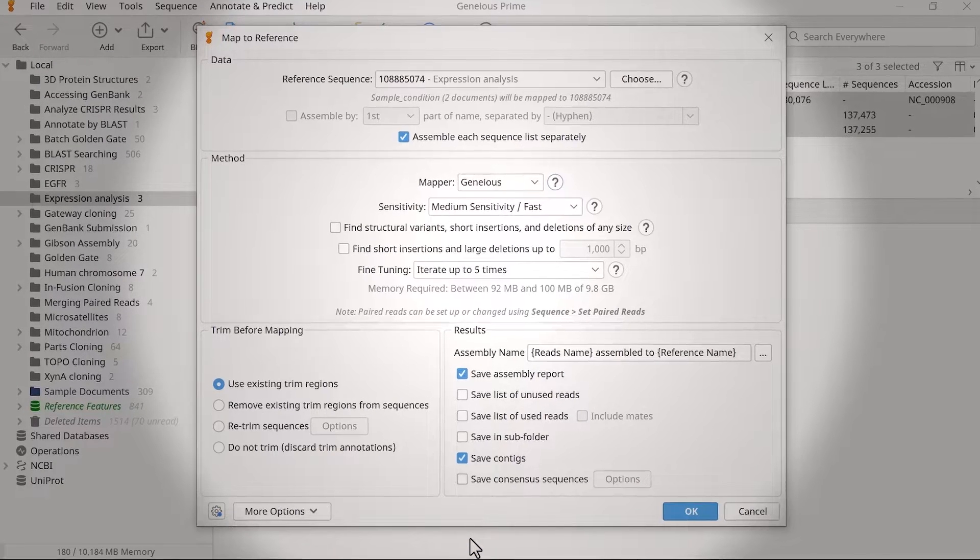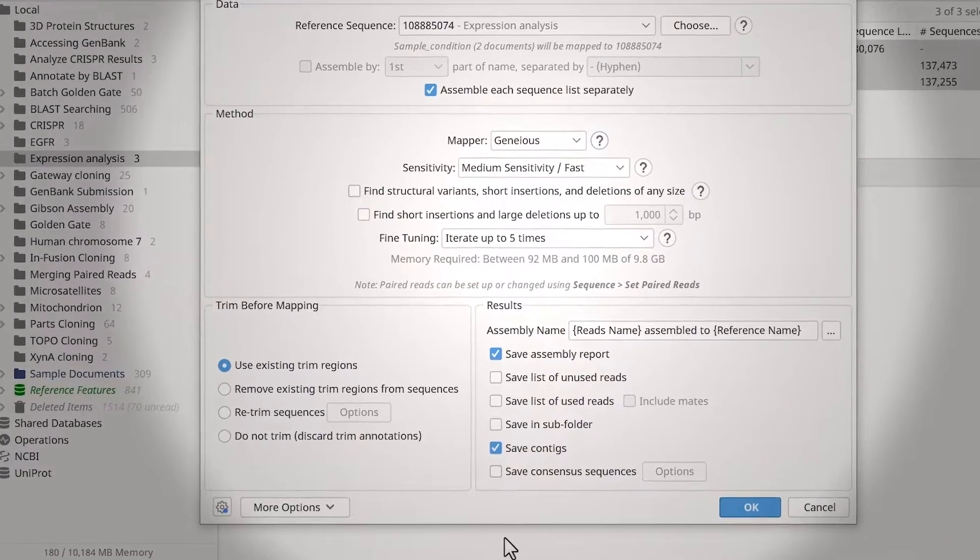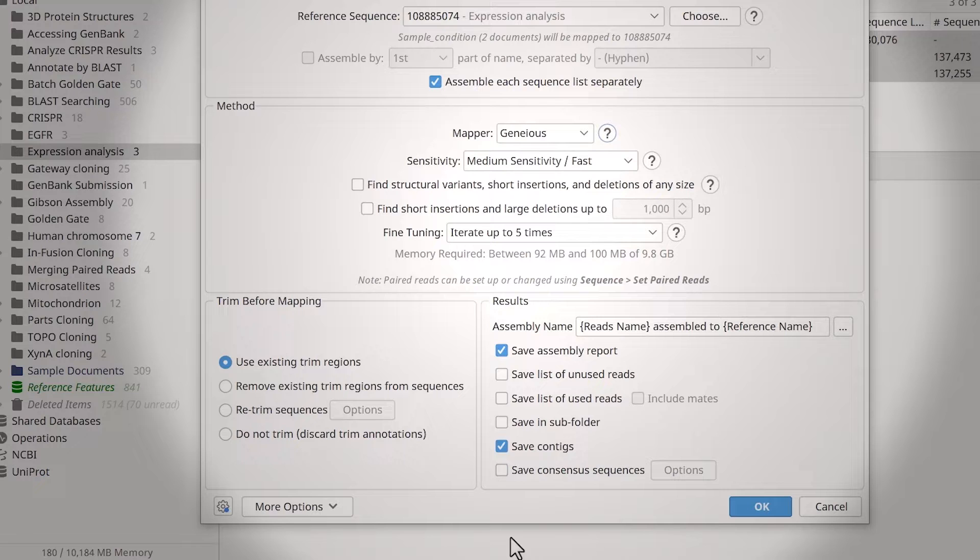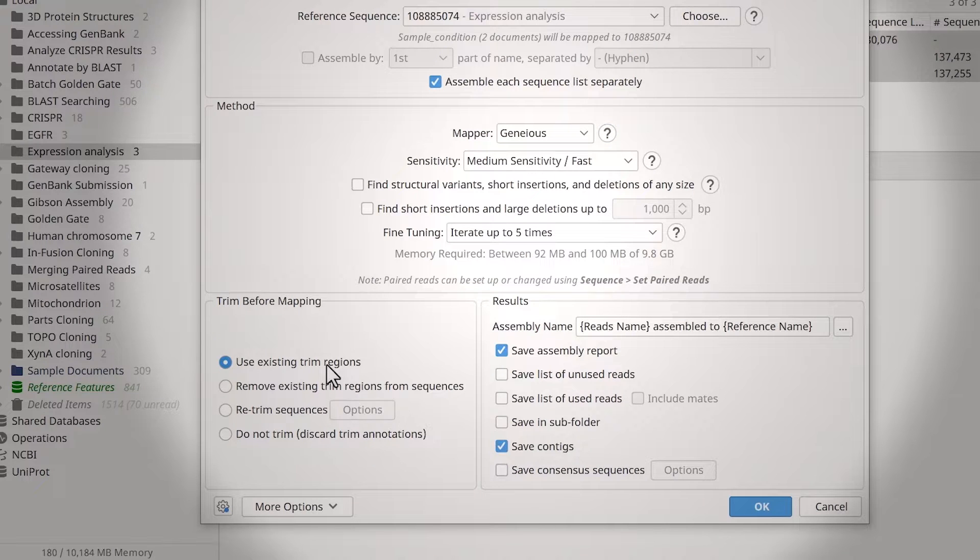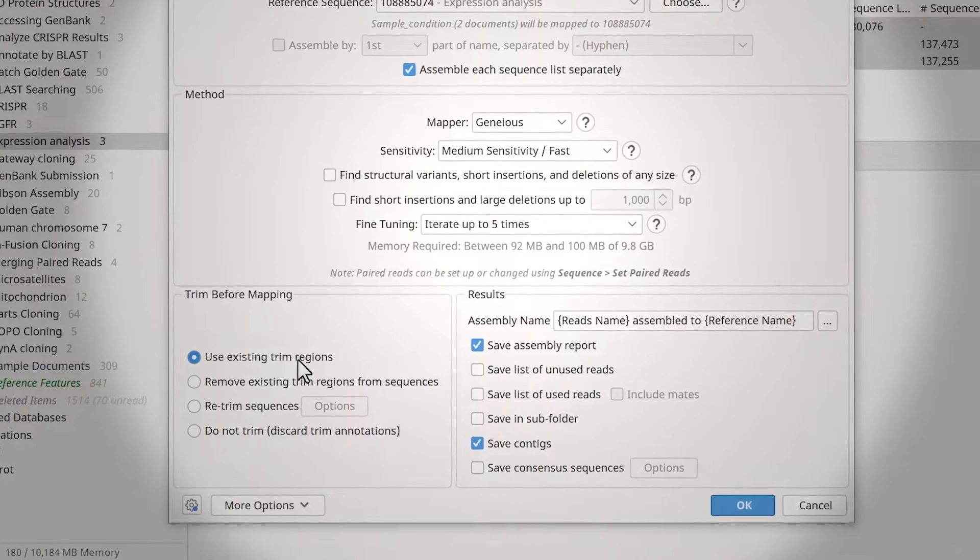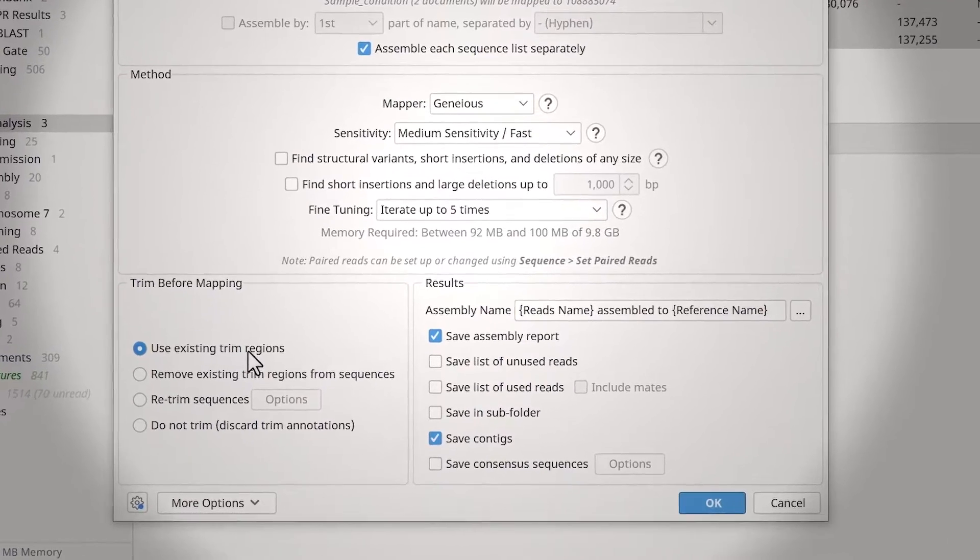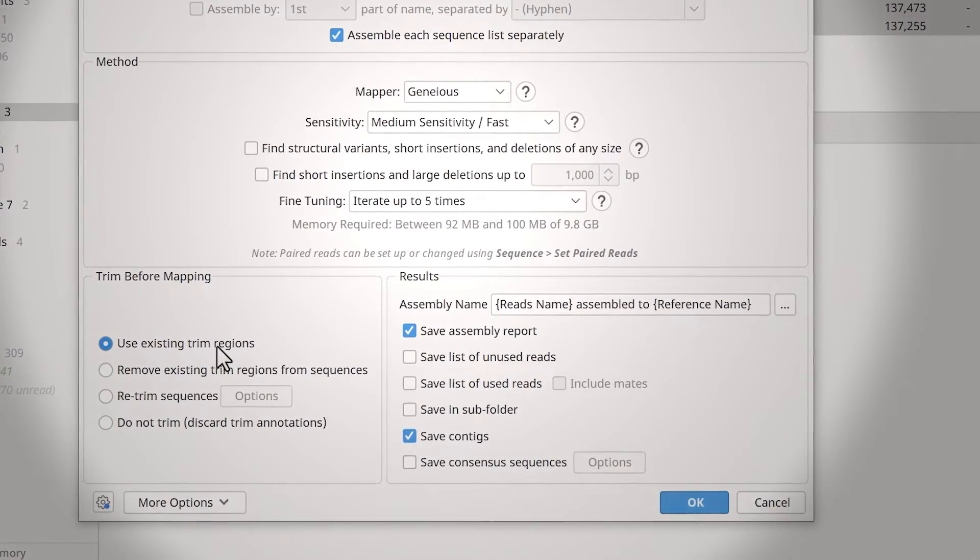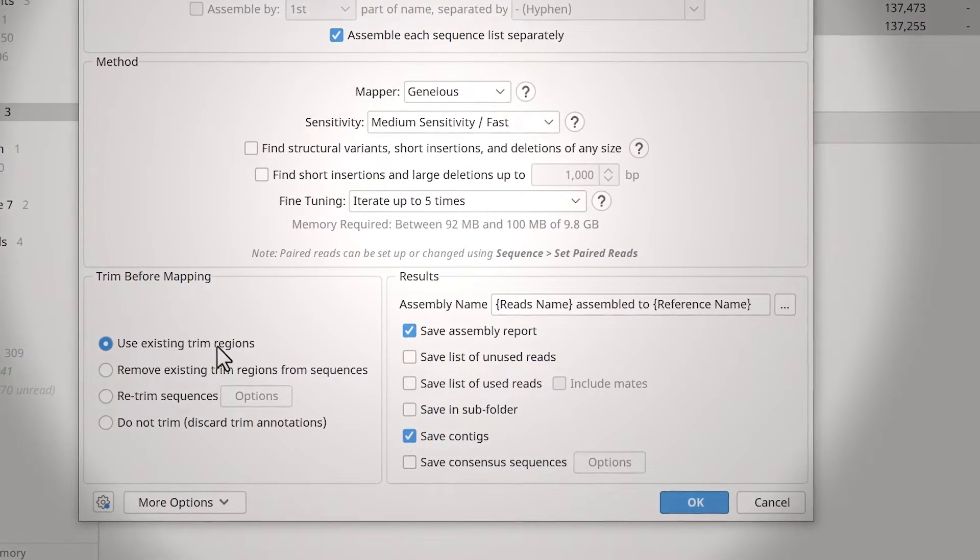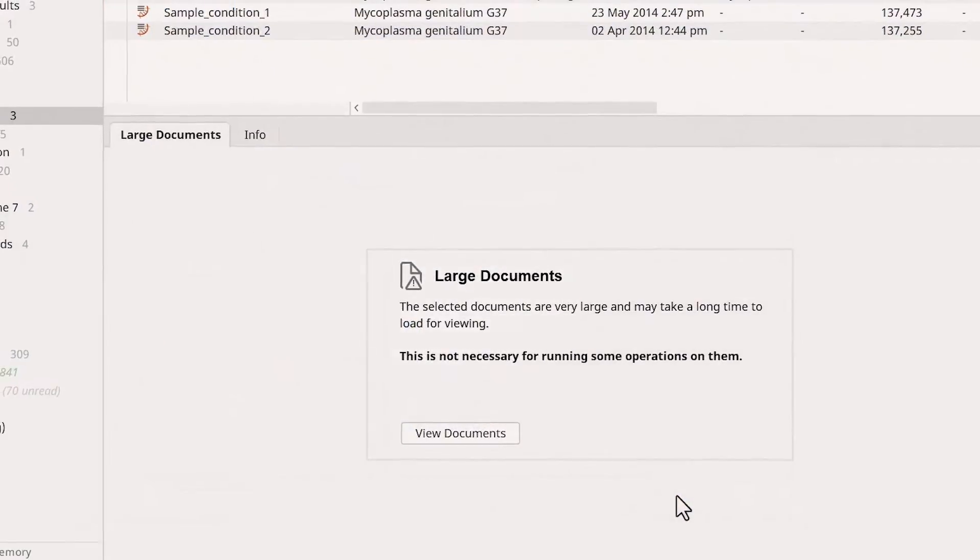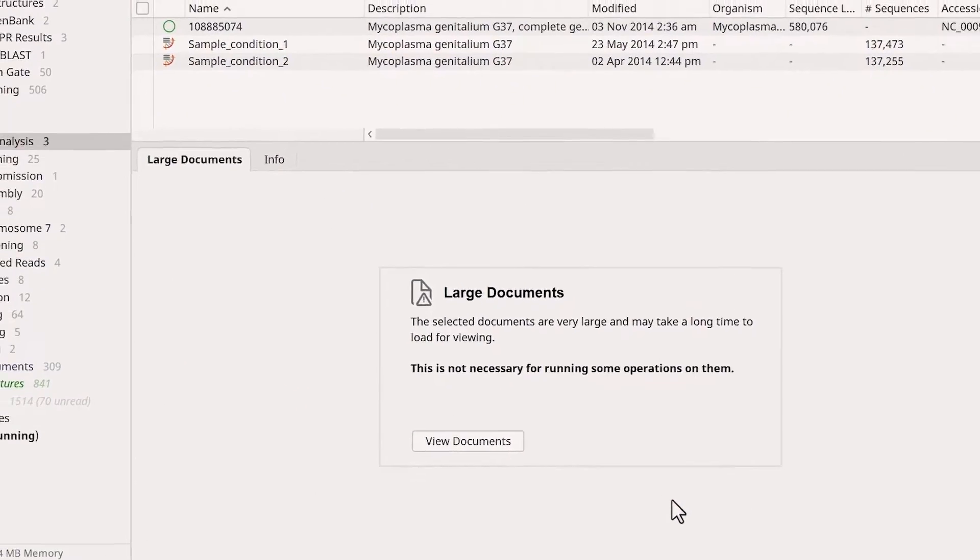In the bottom left of the window, you can specify what level of trimming to apply before mapping. For this example, I will use existing trim regions. In the bottom right, you can adjust what results should be returned from the mapping. When you're happy with the settings, click OK to run the assemblies.